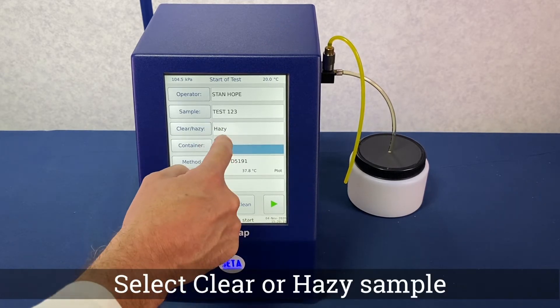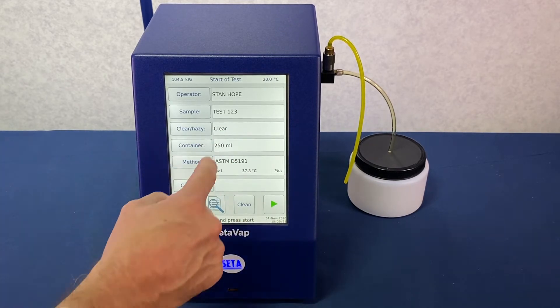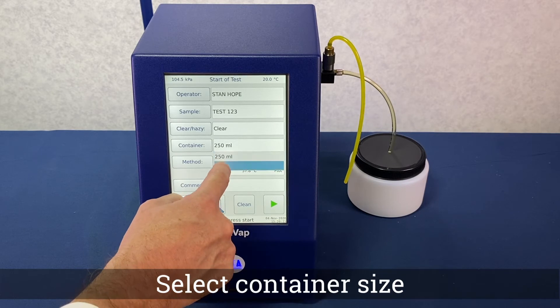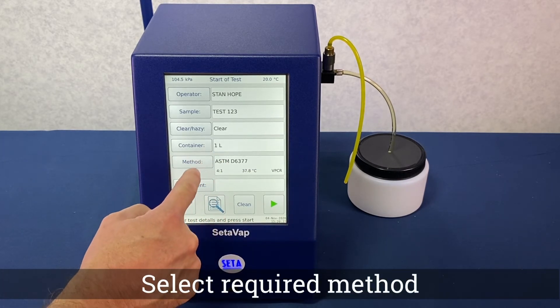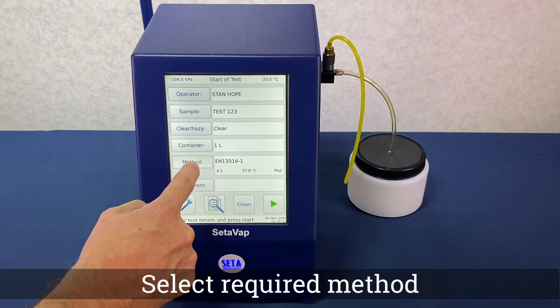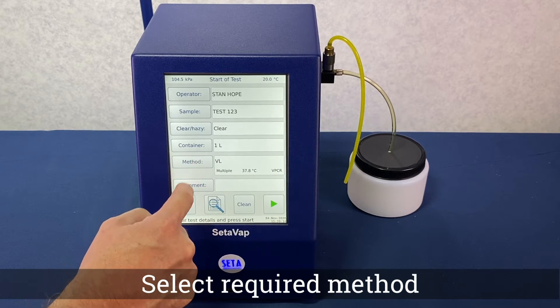Select either clear or hazy sample. Select your container size. Select the required method by either pressing the method button to scroll through the options or by pressing the method field and selecting from the drop-down list of available methods.